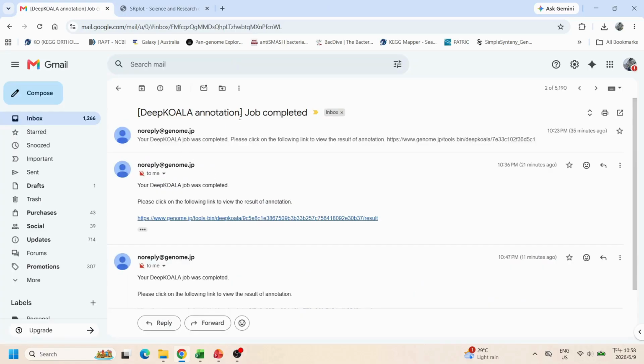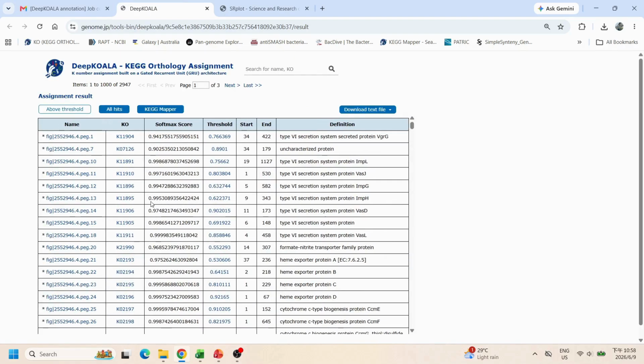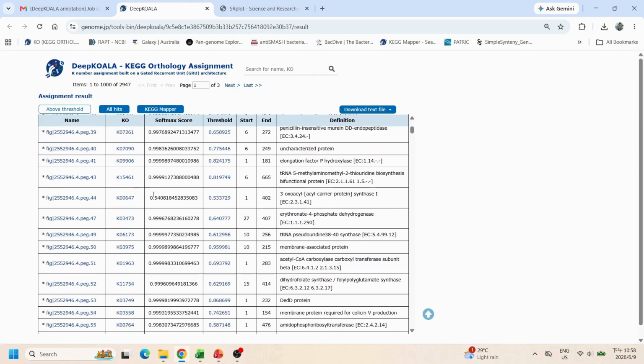You will be notified via email once the job is completed. Click the link to access the results. You can download the assignment results here.